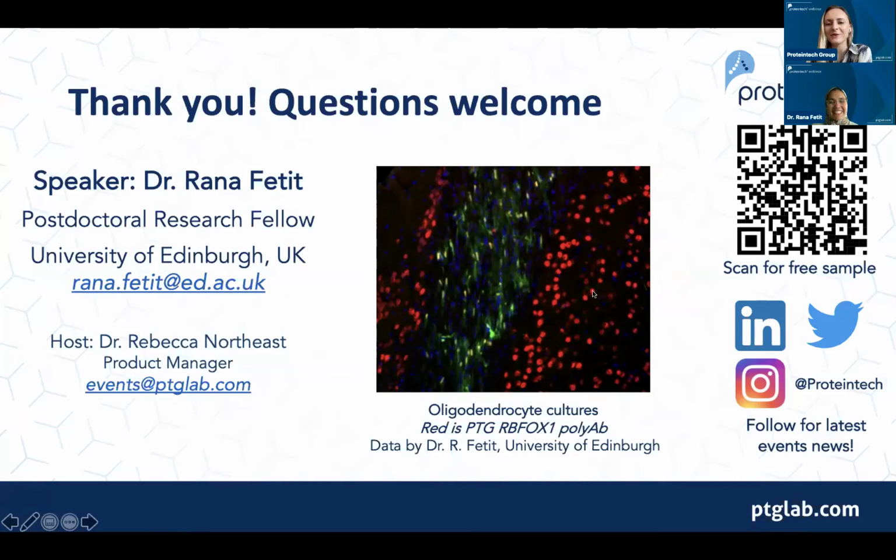Yeah. And then one more question is, someone is saying that during their experiments, they have a lot of cell death during reprogramming. What recommendations do you have to prevent this? So during reprogramming, as in changing them from somatic cells to stem cells, is that what you mean? In general, if you have an increase in cell death, then maybe look into the treatments that you use, as in how harsh are these treatments on the cells, and how vigorously you are resuspending the cells. Maybe try to optimize the protocol, as in the duration you keep them in the different stages. But I would need more details to help you with the optimization, as in what exactly you are looking at, or where exactly that cell death is coming from.